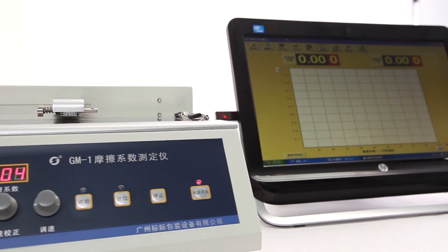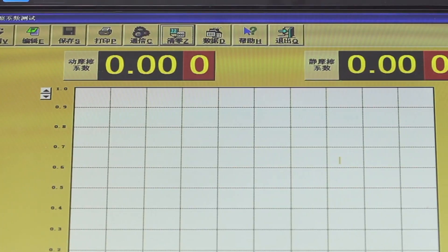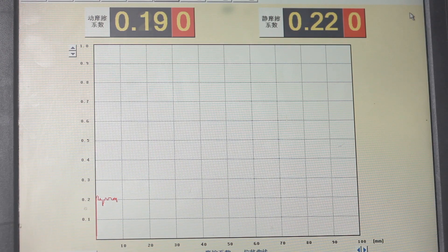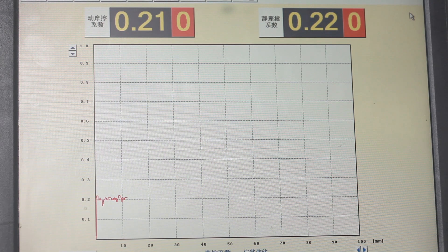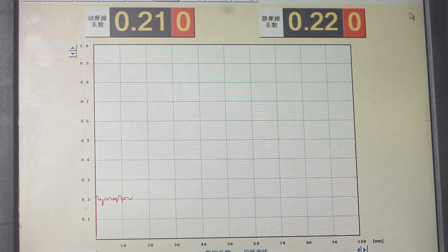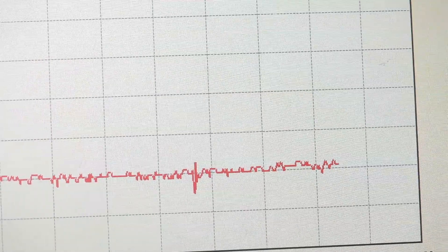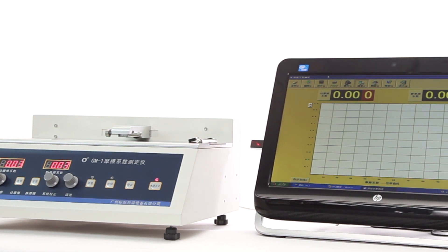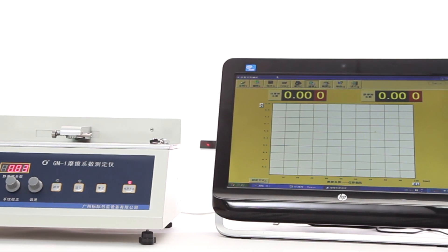GM1 has professional software, can real-time display 450 records of static and kinetic coefficient of friction data and curves during the test process, can create and print report and curves by computer.